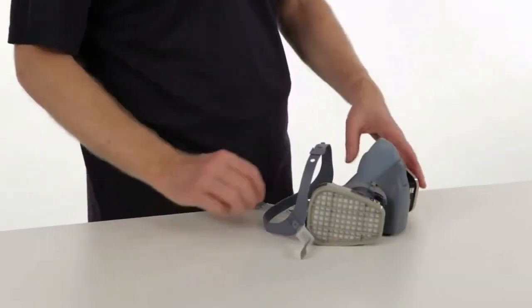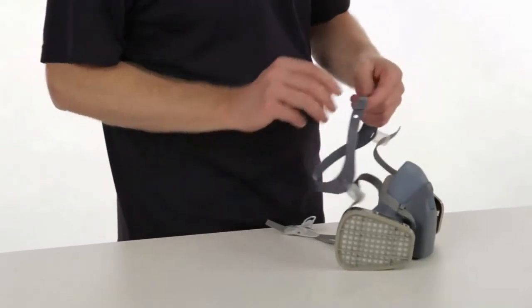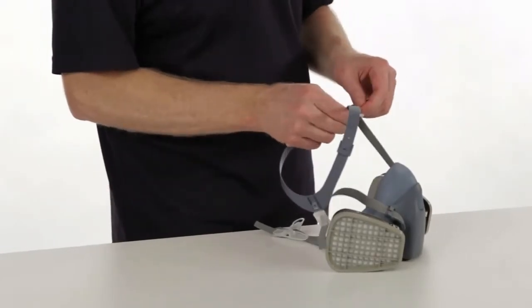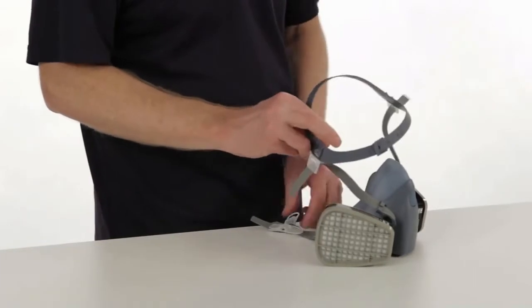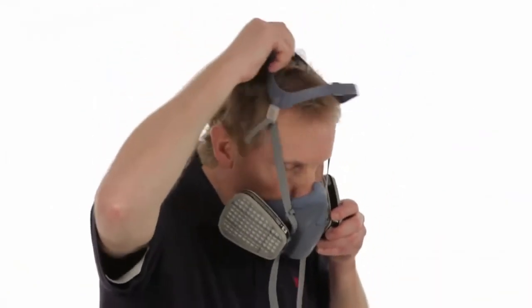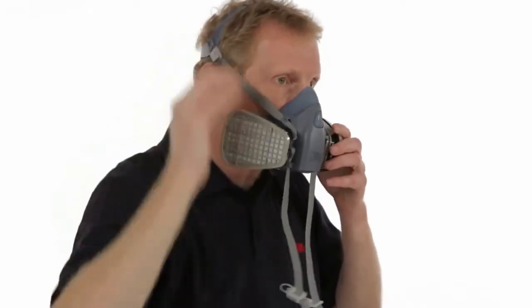Donning 7500. Donning the 7500 half facepiece respirator can be done one of two ways: standard fixed suspension or drop-down suspension. Let's cover standard fixed suspension first. Before you put on your respirator, make sure the straps are beneath the locking tabs, untwisted, and pulled far enough through the buckles to permit easy grasping. Adjust the head cradle size as needed to fit comfortably on your head.